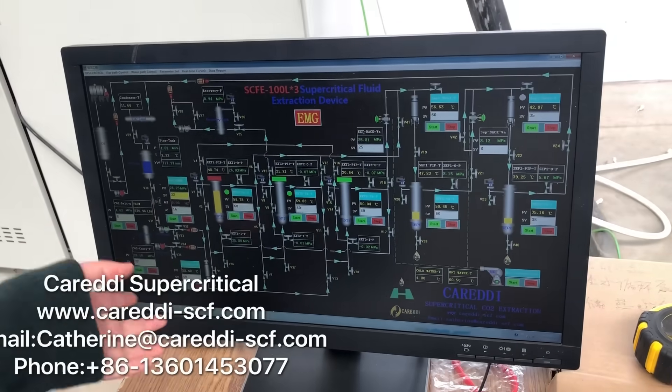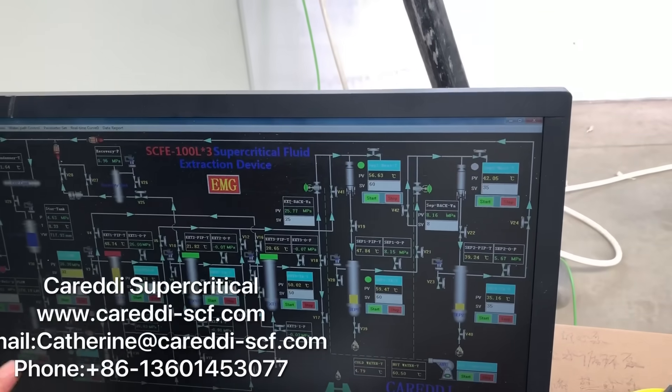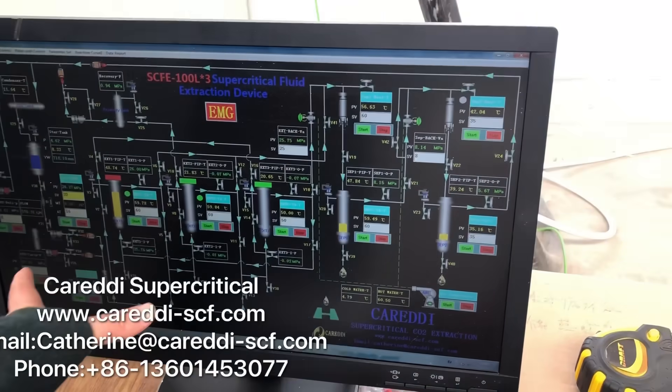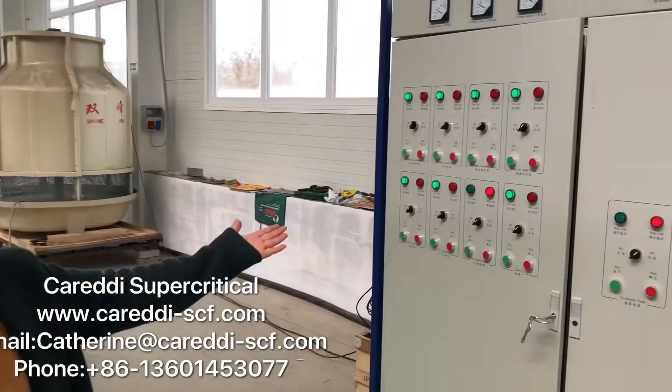From the computer software, we can control the temperature, the pressure, and control the pumps and valves automatically. This is the electrical control panel.